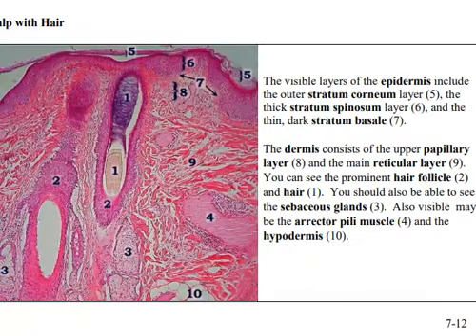This is a slice of scalp from someone who did have hair, and so you're able to see a little bit better. There's the hair follicle, and there's the hair coming up the shaft, and here's the erector pili. So it's starting over here, and if you see, they've sliced it away, and then you see another piece of it right there, and then they've sliced it away so you don't see where it actually connects here. So you kind of have to fill that in your mind. There's the muscle, the erector pili.